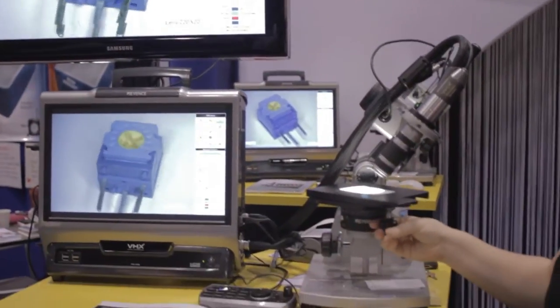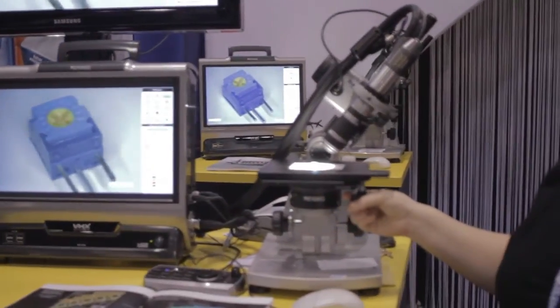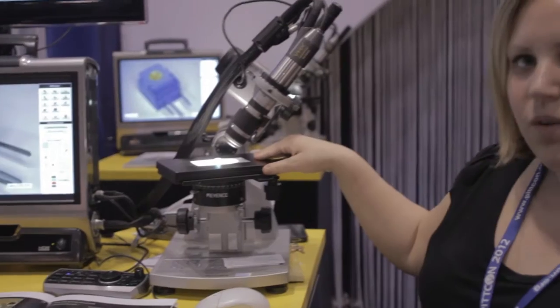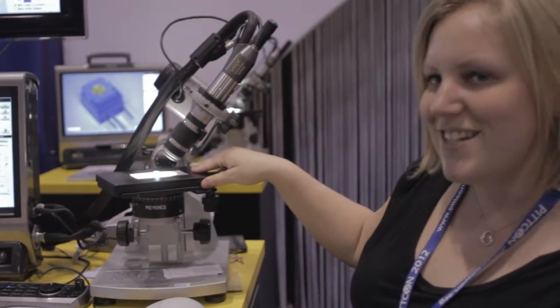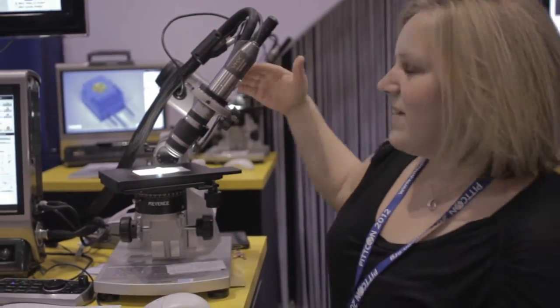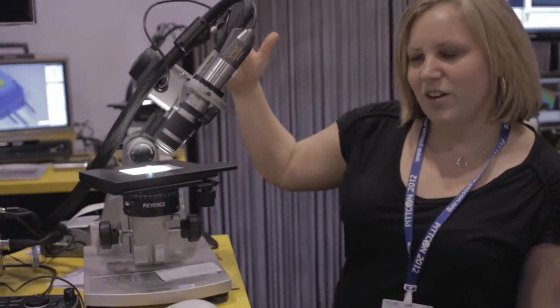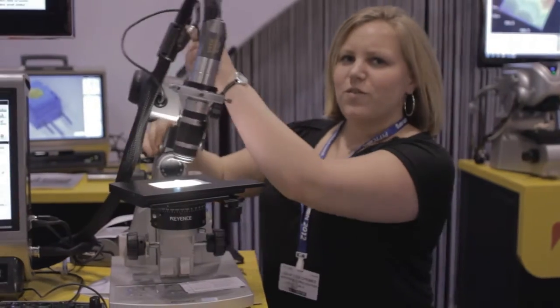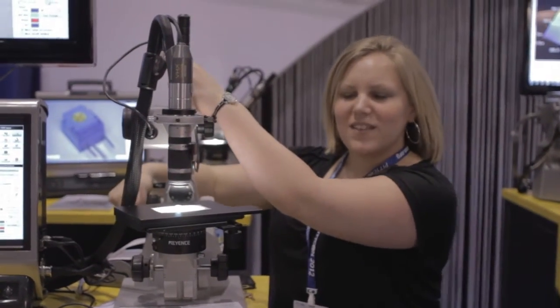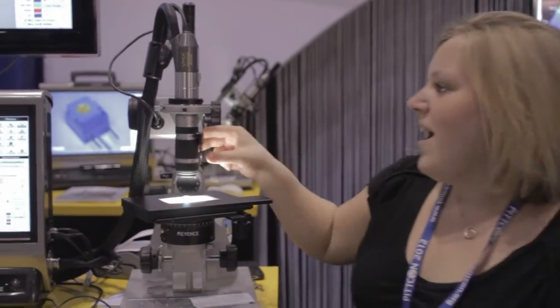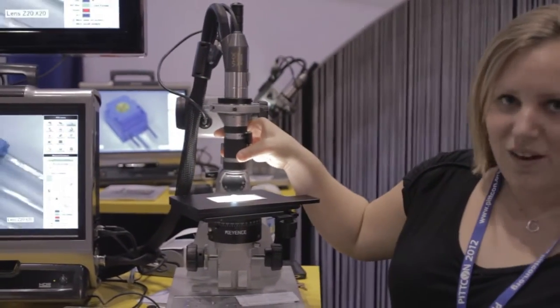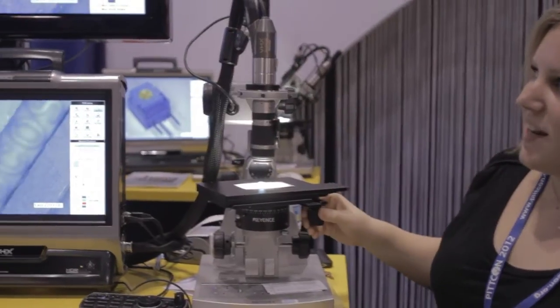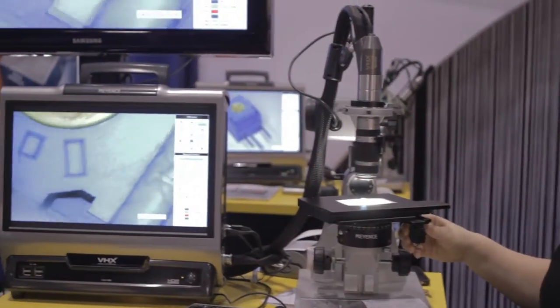To take advantage of that, we've got a stage here that will rotate a full 360 degrees, and the arm will tilt down to a full 90 degrees. So for a lot of people that are fussing with putties or fixtures or anything like that, ideally you can avoid that nightmare just by using our standard stage here.